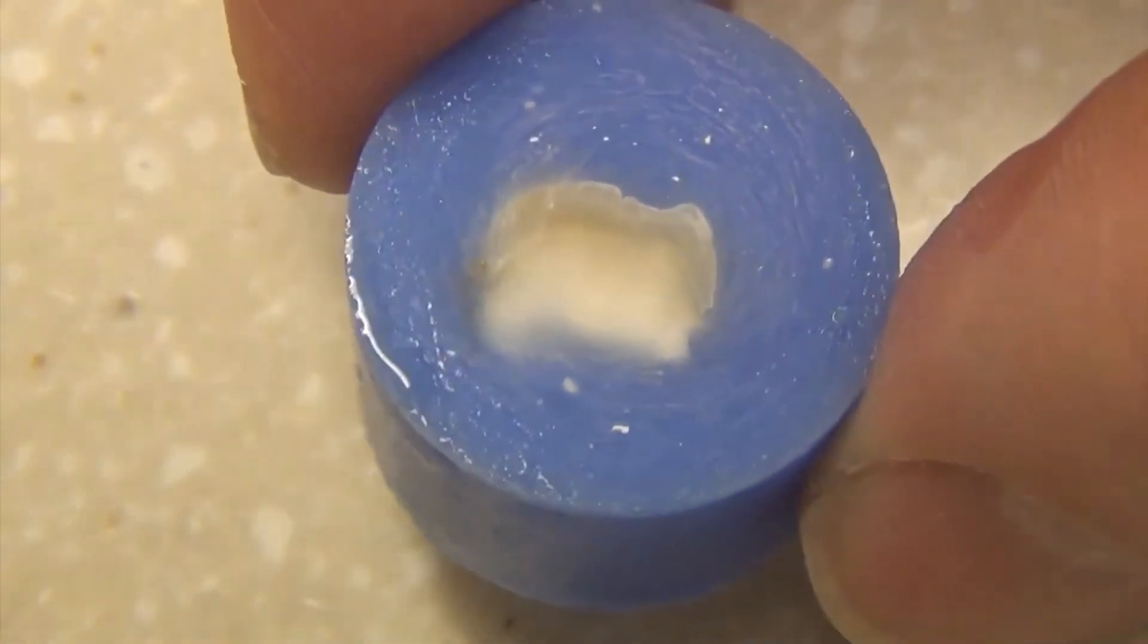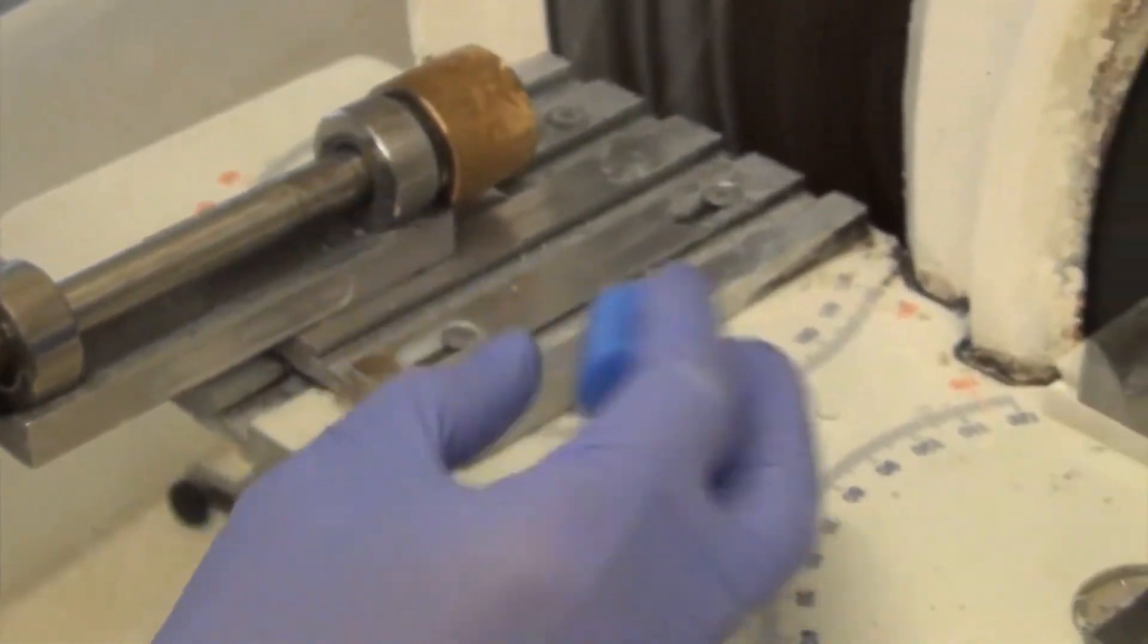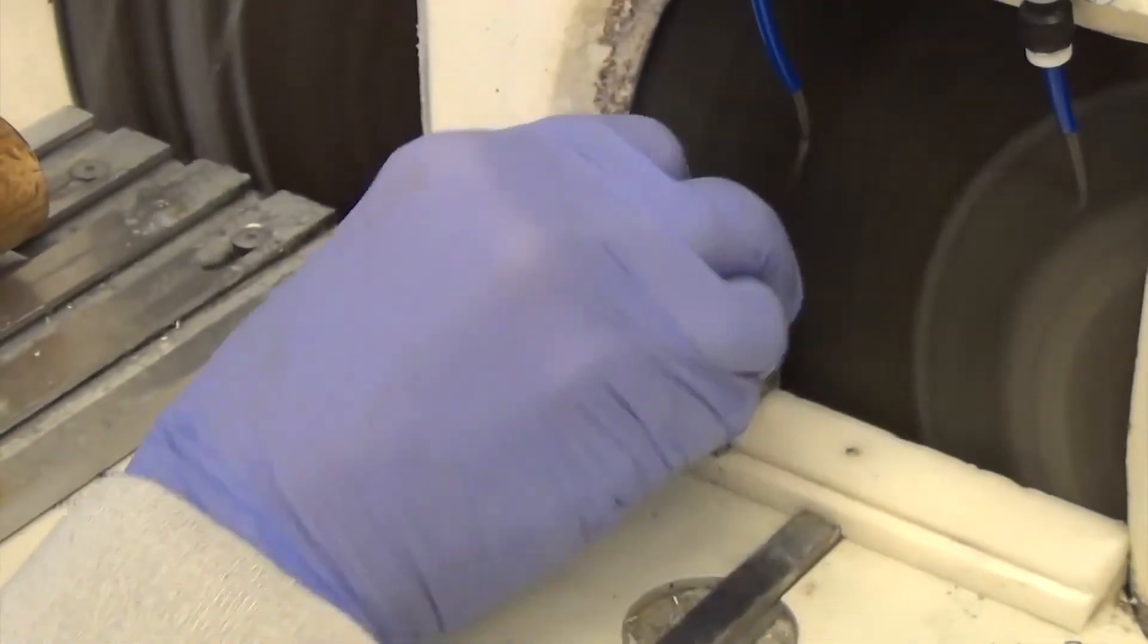Now we don't want to be bonding to enamel when we're trying to bond to dentin and we don't want to bond to dentin when we're trying to bond to enamel. So this is kind of a delicate balance of looking at what surfaces we want to bond to.